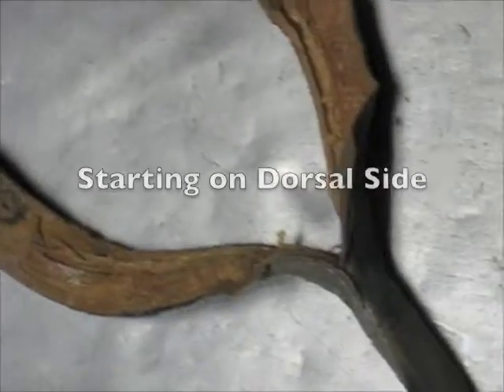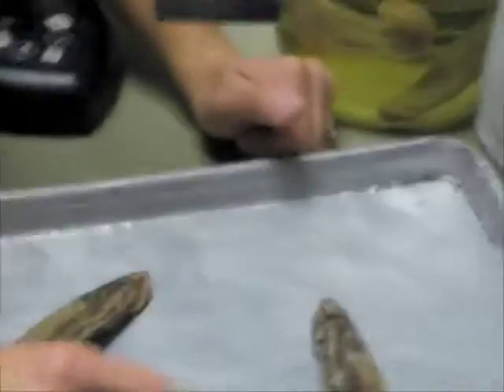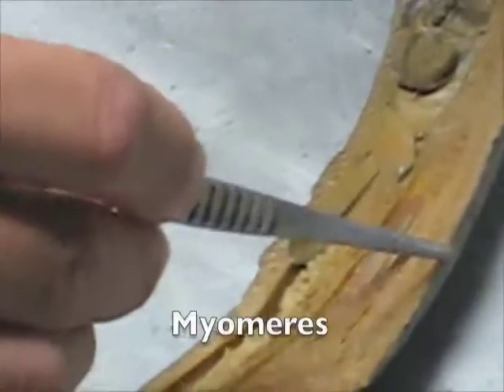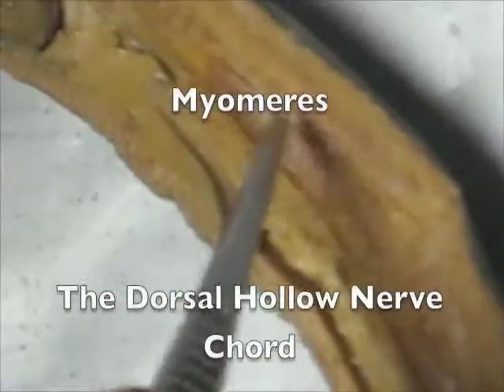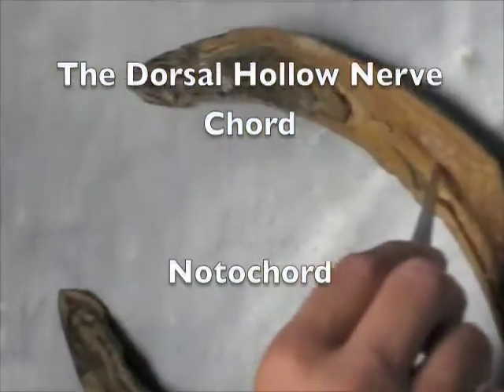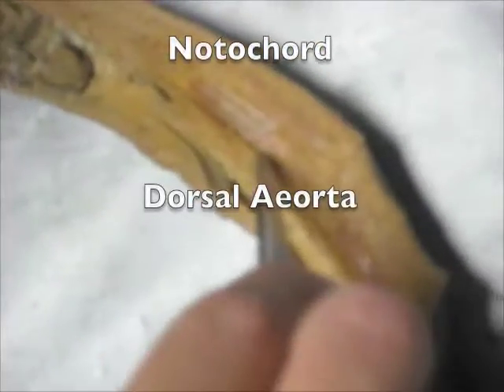If we start on the dorsal side, we're going to come through the myomeres. The next structure down from that is the notochord. The next major structure down is where the dorsal aorta would be located. So we've got myomeres, everybody see? Here, you can't see that. You've got myomeres right here, your dorsal hollow nerve cord, and then here's the notochord right here. And this groove right here is the dorsal aorta.